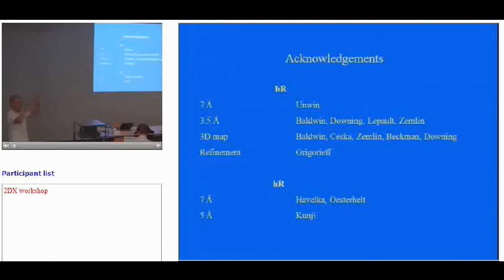So if you looked at a big area, even if it was negatively stained, it looked like P6, but actually it was P3. That's why, if it's a new structure and you're suspicious about it, for example with 3-fold, 6-fold, or 4-fold axes in your crystal, it's quite useful to divide up all the unit cells and put them into Spider or Magic and just see what happens. It will be able to sort them, even though it's below the noise level, into the 2 pictures, and that's what you'll be looking for. Until you do that, you could easily have missed it.